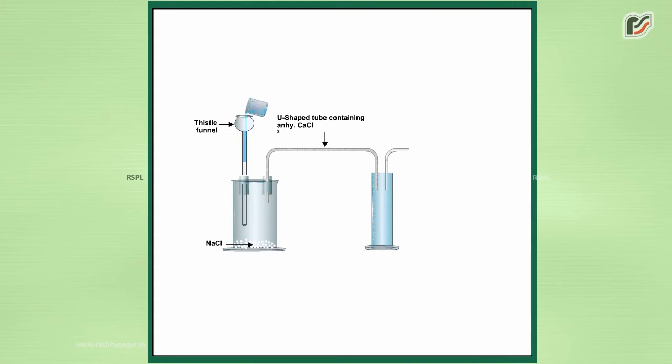Add concentrated H2SO4 into the conical flask with the help of a thistle funnel very carefully so that the concentrated acid does not come in contact with body or clothes.